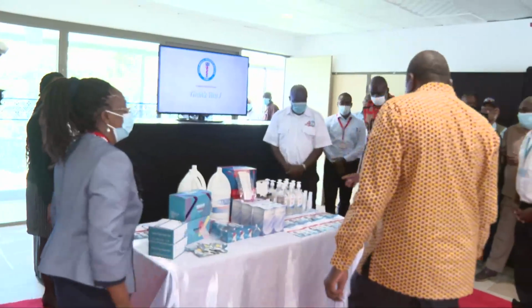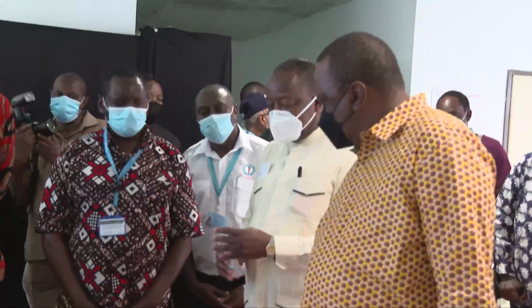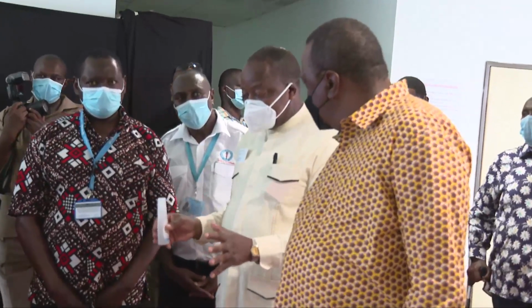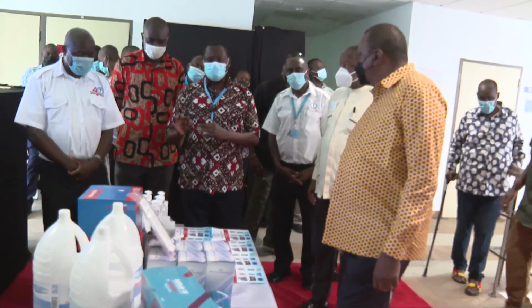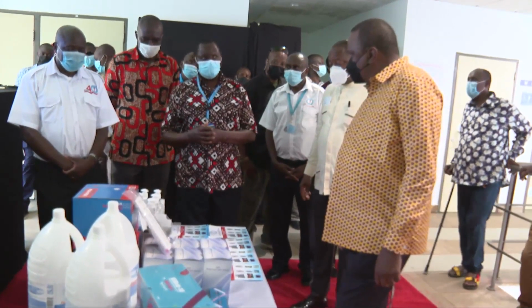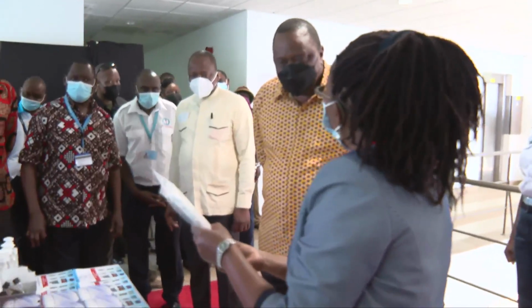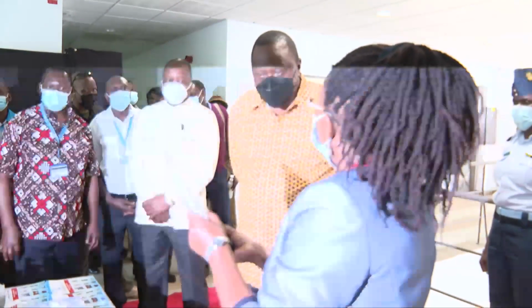When we were really desperate for sanitizers, they were the first ones to actually give us sanitizers in mass production. But this one meets very high standards. It's very much taken by the population. Yes, when we were not able to pick the samples, viral transport media, VTM.